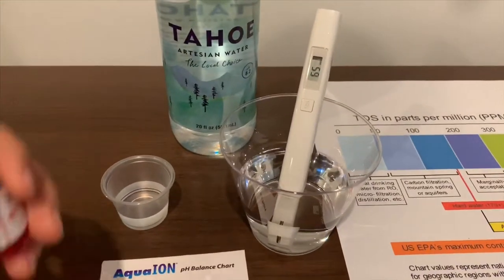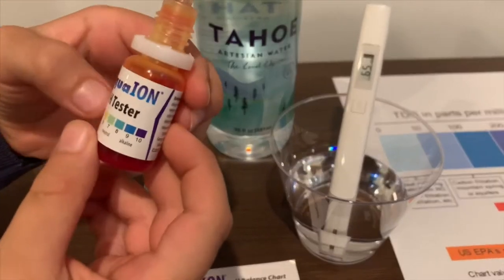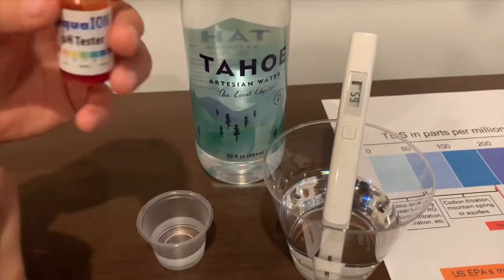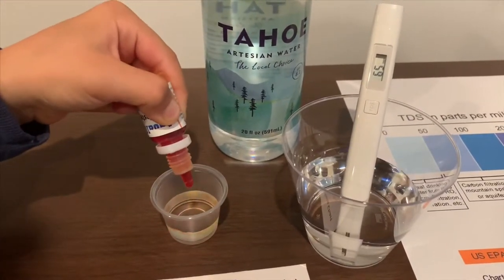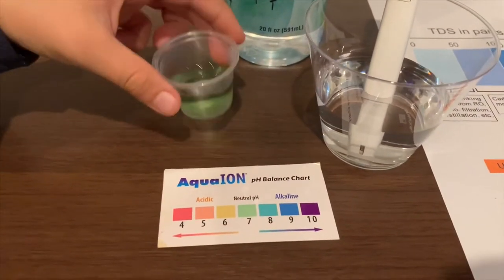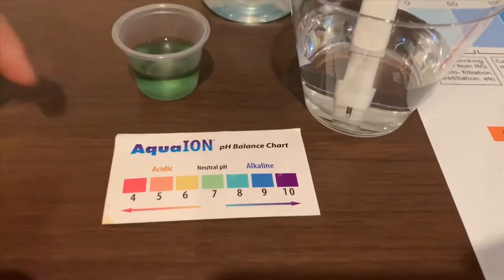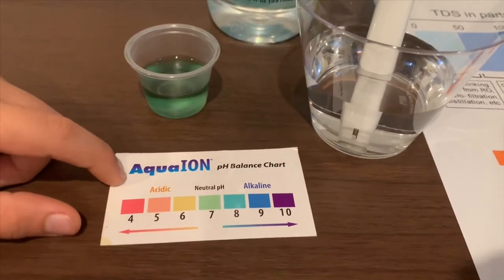Now let's test the pH level. If you want to buy this pH tester, check the link down below. I'm going to do two drops. I'm going to give this a 7.5 — neutral pH.